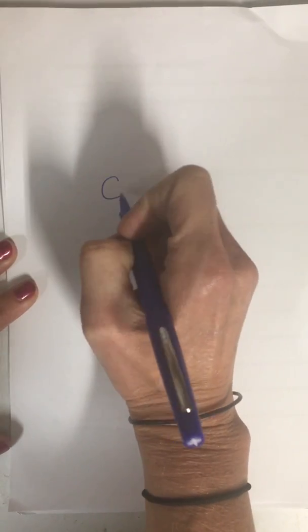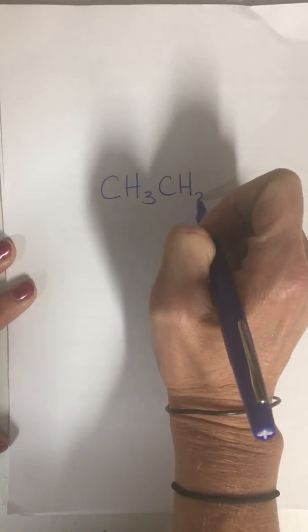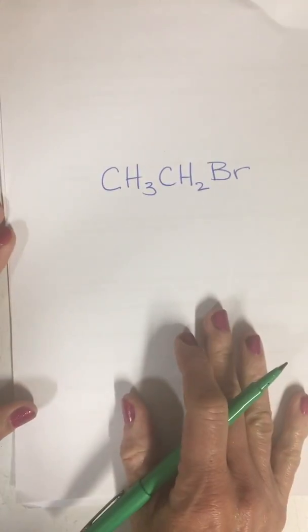But anyway, we're going to start with a little basic molecule that you guys are used to counting the signals on. Let me just write this out. We've done things like this in lecture already, where you're used to figuring out how many signals would pop up on your NMR spectrum. So we're looking for unique groups of hydrogen. In this one we would have two signals, right?